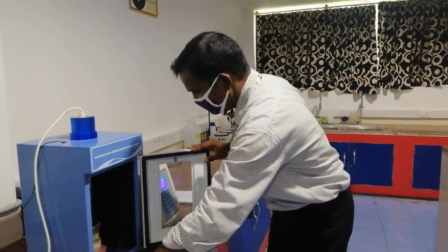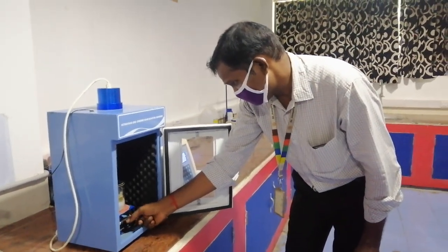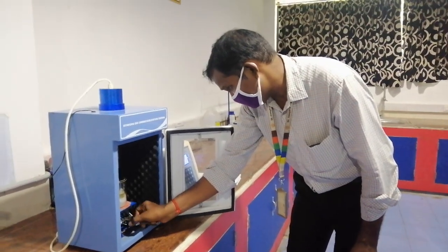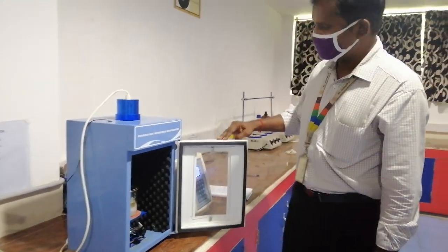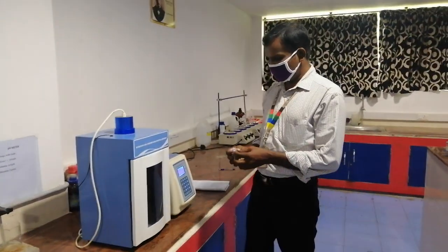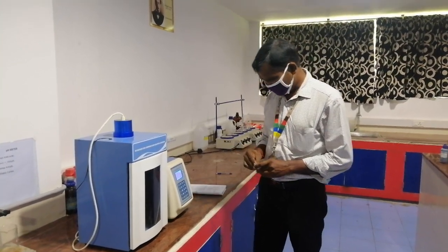Similarly, we should continue this process for 10 different cycles. So for the third cycle we have to go for another 30 seconds. Therefore, the total time will be 90 seconds. After taking the sample after the second cycle, I kept the beaker again inside, and the probe is also immersed. Then we can go for the third cycle. Similarly, repeat this 10 times. Therefore, you will have 10 cycles. After each cycle, you will have the samples. So centrifuge the samples, and then using the Bradford assay, find the protein concentration in your samples.